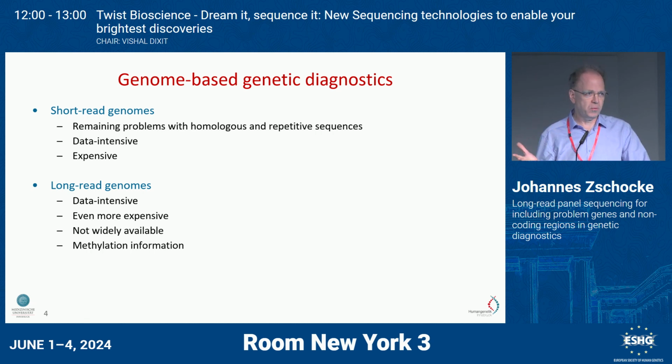They are even more expensive than short-read genomes, and they are not widely available. So this is not really suitable for the standard diagnostic purpose. We get a couple of dozen samples for cardiogenetics, for example, per month, so we cannot do thousands of long-read genomes in our diagnostic setting. It wouldn't pay in Austria.